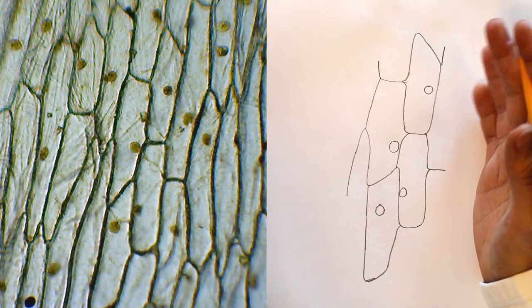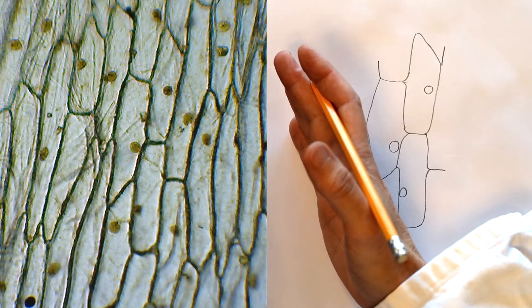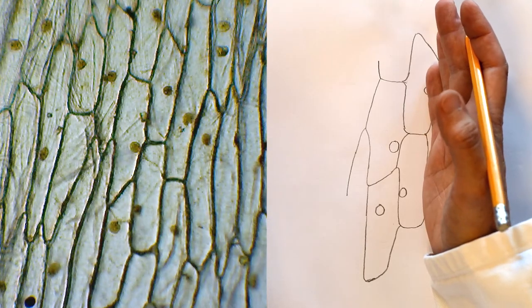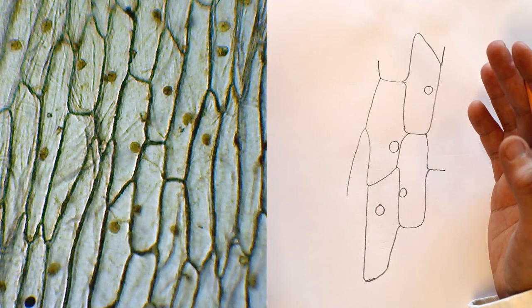Because I can see on the slide where those cells were and I have observed how those cells are interacting with each other. That's the skill that's being tested here.